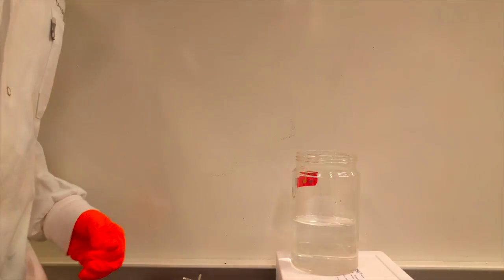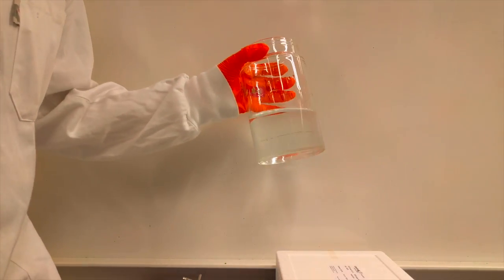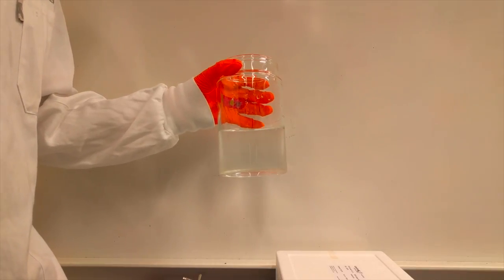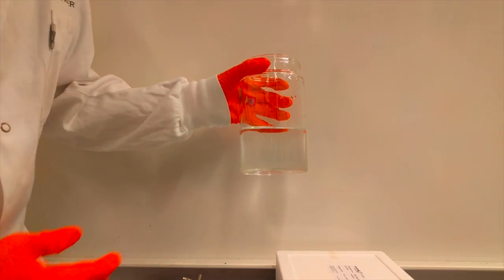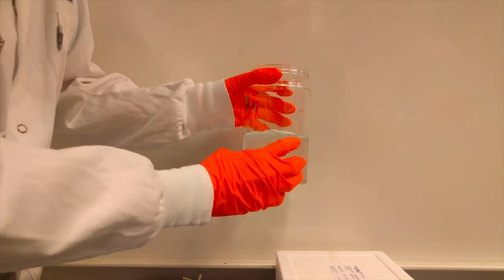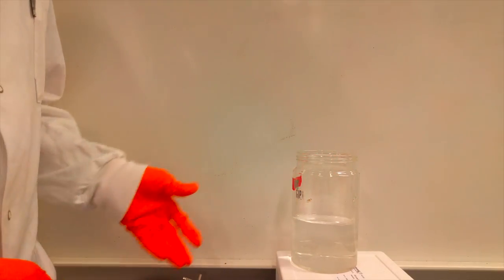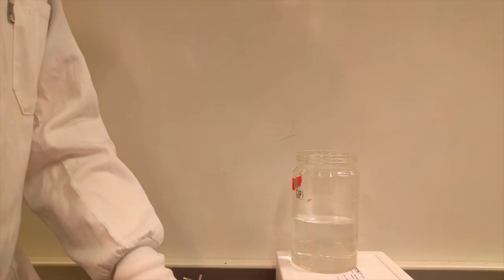All right. So before we get into the fermentation room where things are going to look really complicated, let's build up a fermenter so that we can see what the working parts are going to look like. First, we'll start off with a vessel. So this is a 500 ml working volume vessel. I've put some water in there so that we can see how it's going to look.